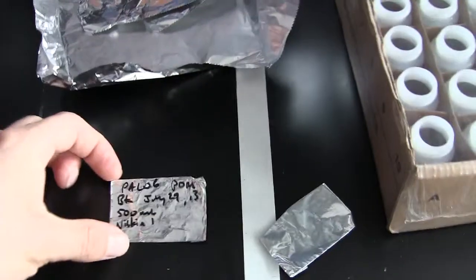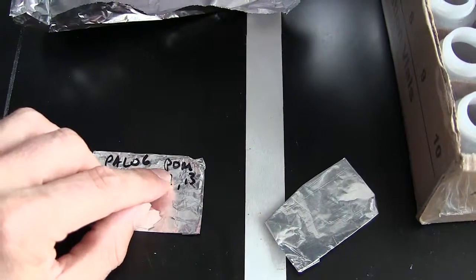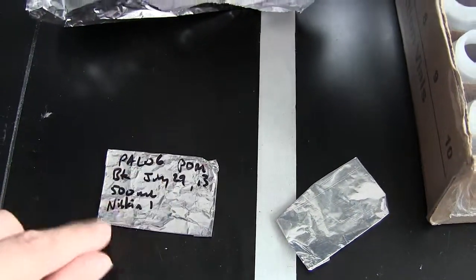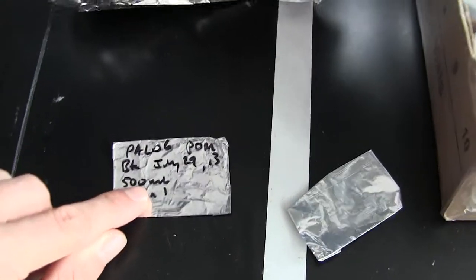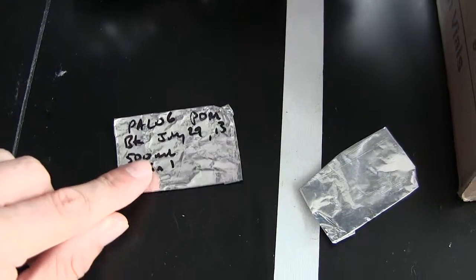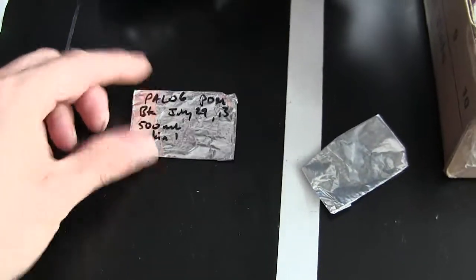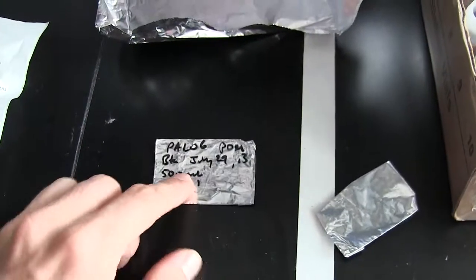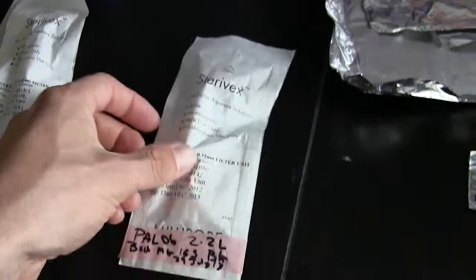And then on the clear surface you'll write the site, POM for particulate organic matter, initials, full date, and the Niskin, but also always write down the volume that was filtered through that filter. No matter what it is, even if you are right on the 500 that's required by the protocol, still write it down so we always have a record of how much was filtered through that on the sample itself. Alright, then that goes in the freezer, and it gets stored with this, which is our 16S bacterial metagenome from the water chemistry set.